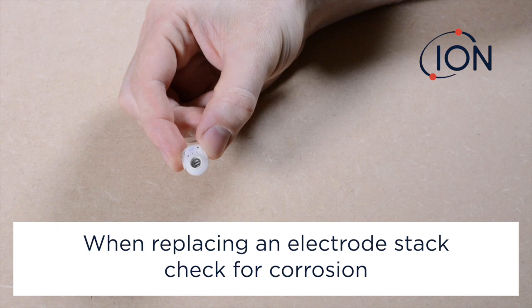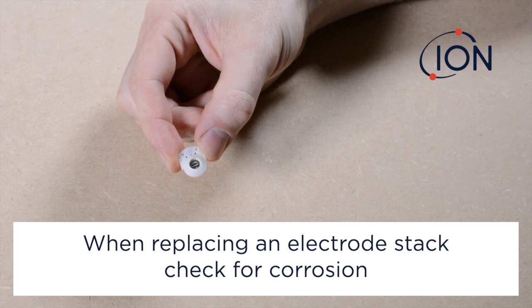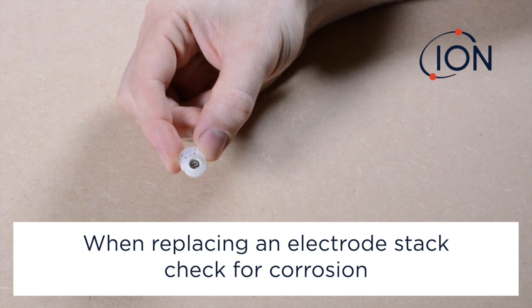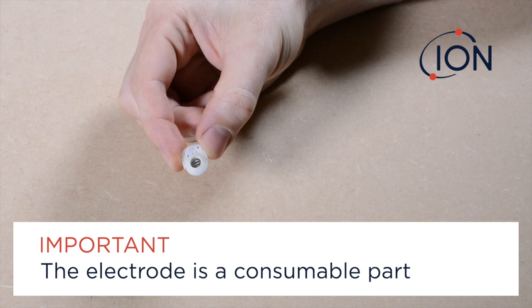When replacing the electrode stack, it is useful to inspect the metallic stacks for sign of corrosion or damage. This will help to determine the frequency of maintenance required in each particular application. Remember, the electrode stack is a consumable part.